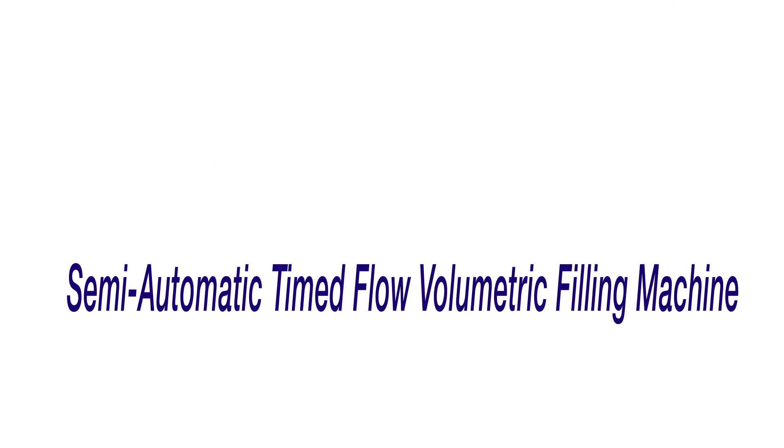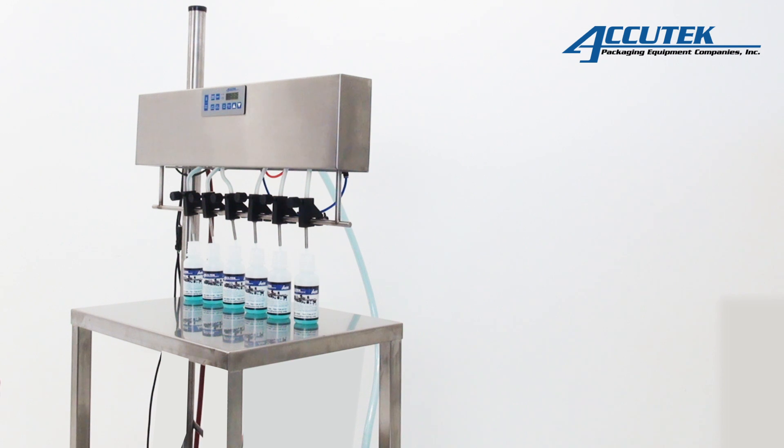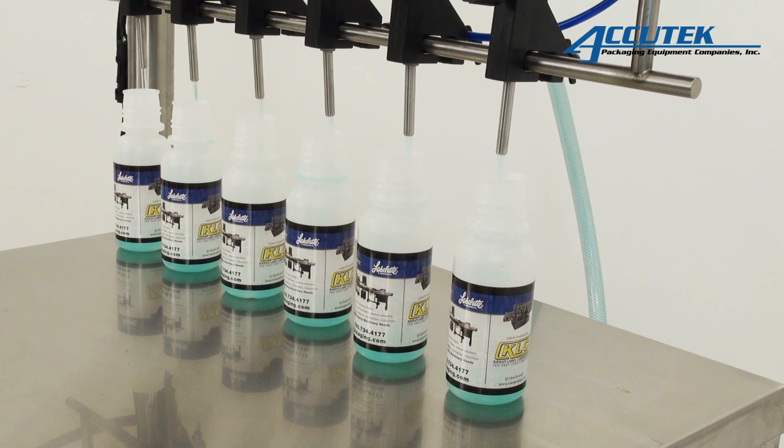The Pinch Series Fillers are time-flow volumetric fillers designed to fill water-thin liquids to oils and creams. All the contact parts can be easily cleaned and are autoclavable, which makes the machine ideal for medical, pharmaceutical, food, cosmetic, and specialty industries.